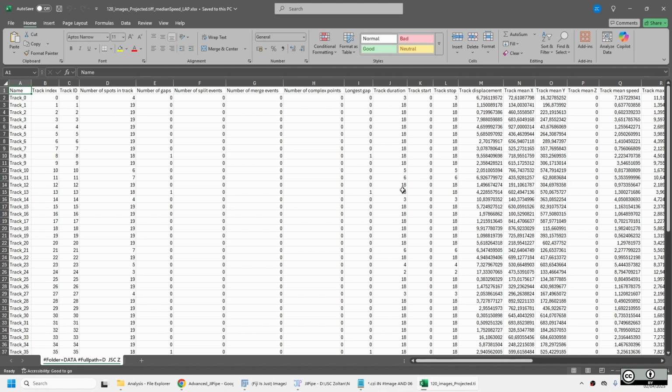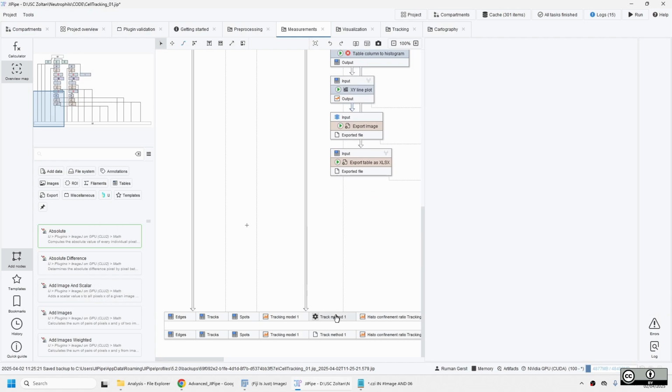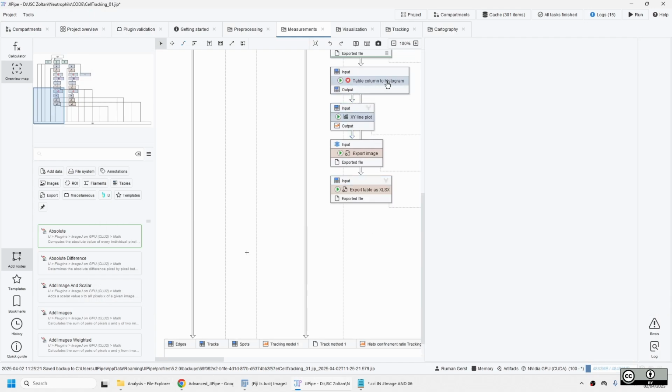So now you analyzed your data, saved your images, saved your Excel sheet. Basically, you are done with characterizing the image. Fairly straightforward, but it really contains every step that you typically use for your analysis. And basically, I was satisfied with this. I added a couple of other options.